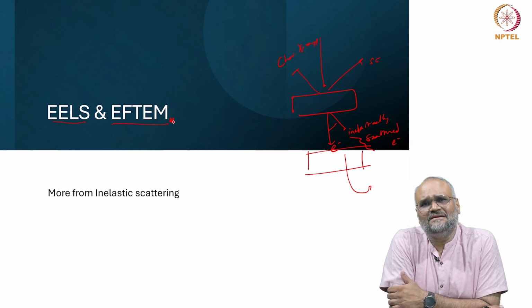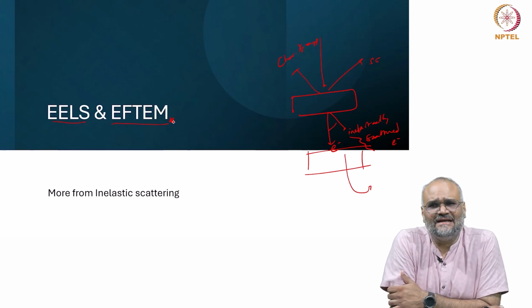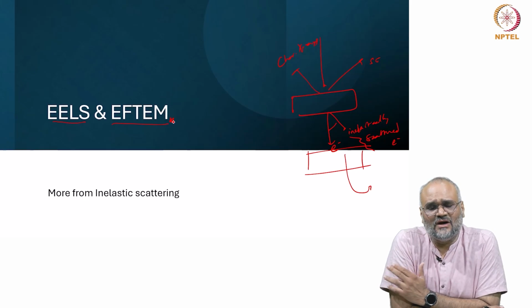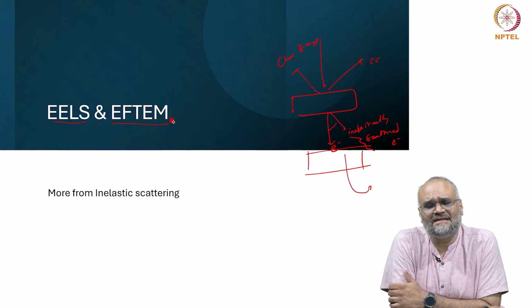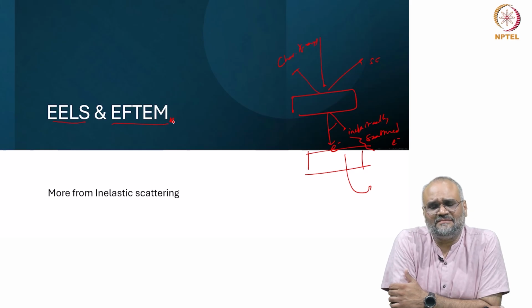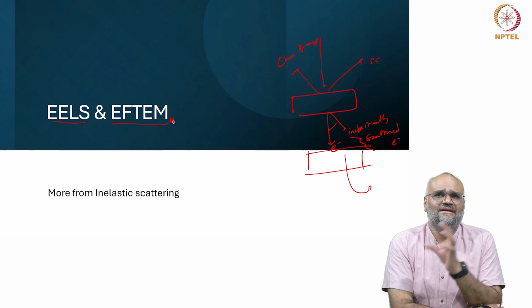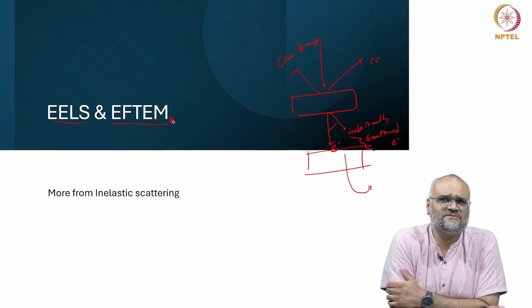Please bear in mind that this entire field of EELS and EFTEM, people have spent decades of their careers on this, and the entire concepts related to EELS and EFTEM cannot be covered in a single course or in a couple of lectures. So what you will see here is only a broad overview of how the signal is, what can be done and what are the applications. But these lectures would not give you complete control on everything that can be done with these techniques. I'll only give you the avenues and you can explore more.